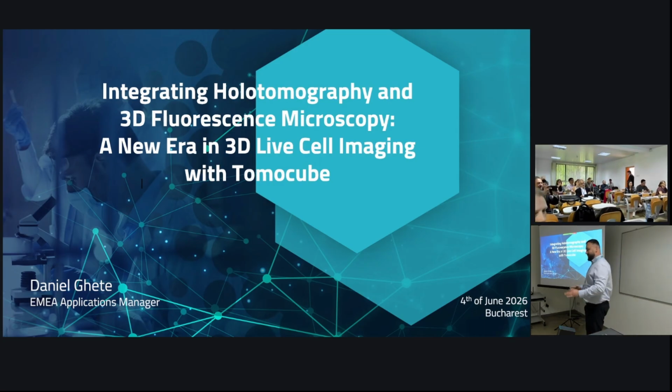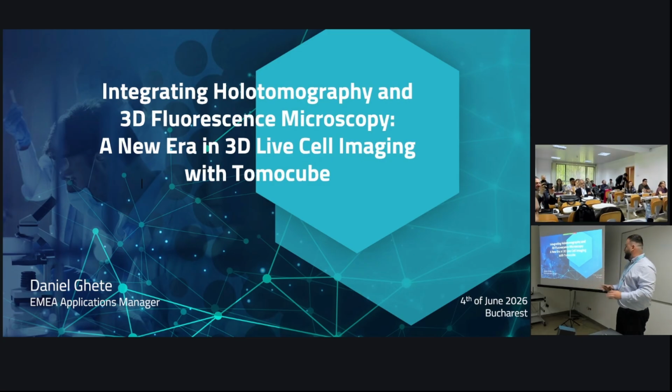So I'll try my best to keep it as short as possible. I know everyone is looking for the coffee. So I'll give you a quick presentation of what holotomography is and how you do it and how Tomocube is doing it at the moment.